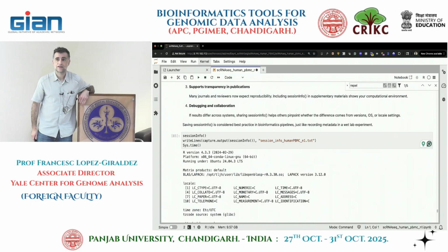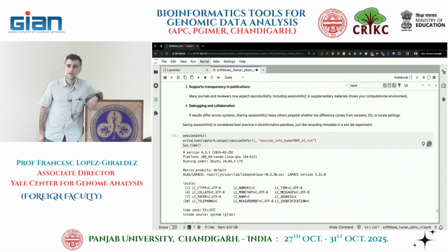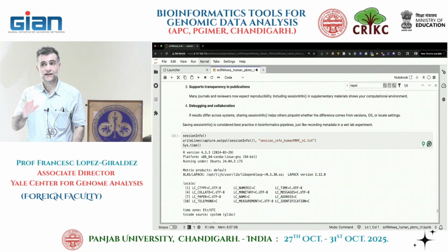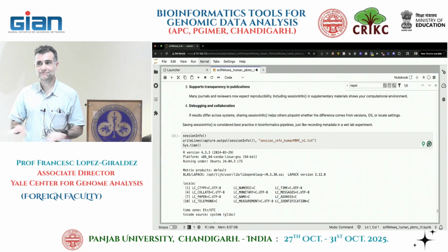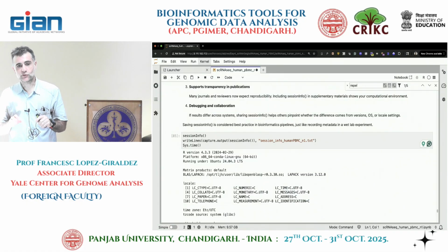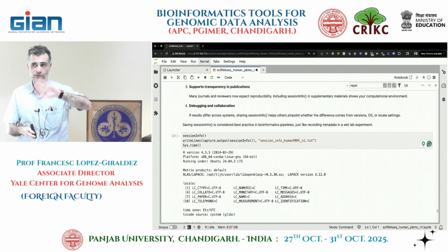No, but if you want to see that megakaryocyte, it's a separate cluster, is it? Like which cluster number is it? Well, Azimuth again ignores your clustering, and it doesn't tell you where the cluster was. When you run Azimuth, you are classifying cells. Whatever you've done previously is gone, so the cluster information is not there now.